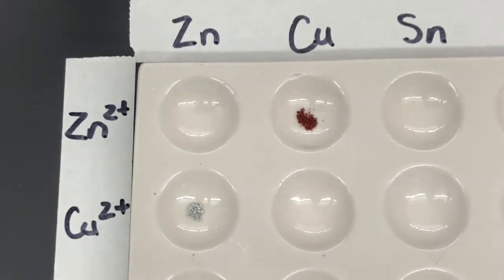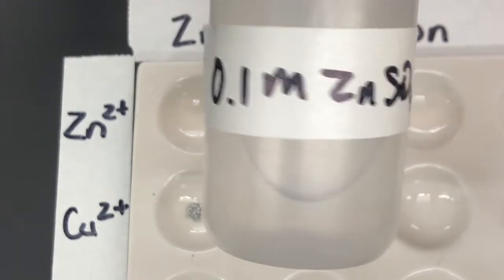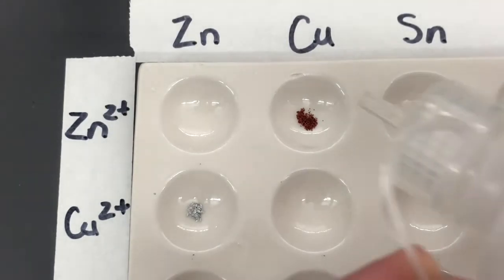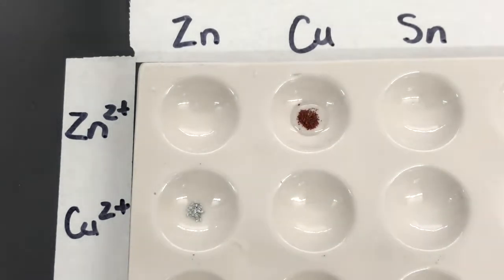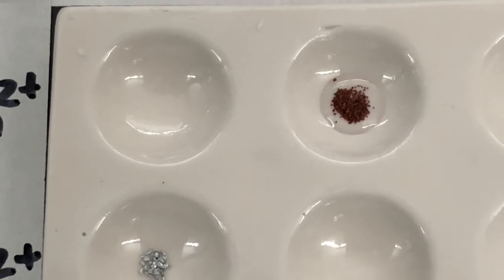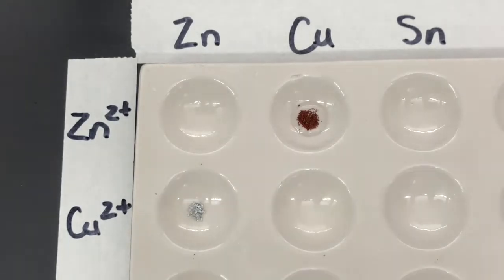What could happen in either of these cases is you may or you may not see a reaction depending upon whether or not the reaction is spontaneous. So for the first reaction, I'm going to take 0.1 molar zinc sulfate, and I'm going to add a couple of drops of zinc sulfate to copper. And you'll notice in this case, we can zoom in a little bit more. Nothing is really happening right now. We'll come back to it in a little bit, see if any reactions did take place.